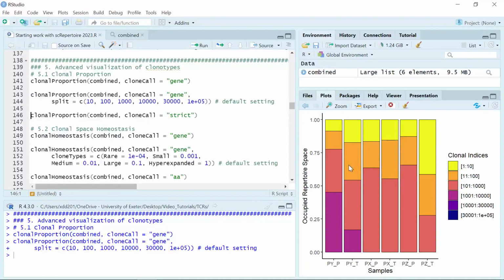So we know the highest abundance in this dataset is 482. So actually you can change the default settings here to have a color range that is more suitable for your dataset. For example, for this dataset, we can set the upper limit as 500.